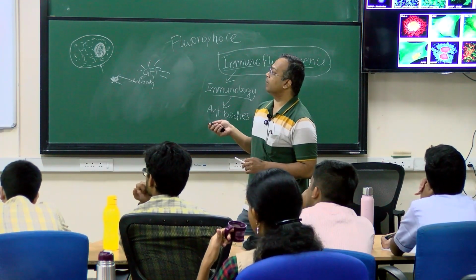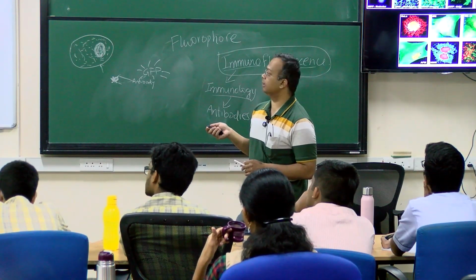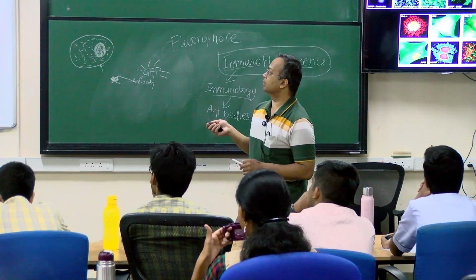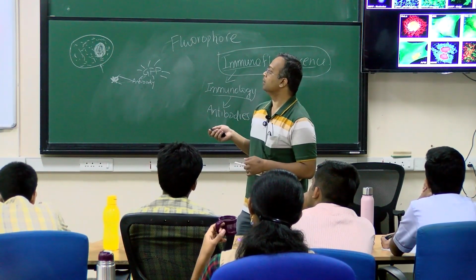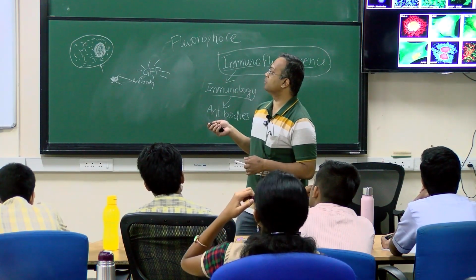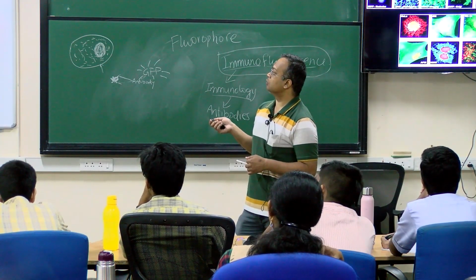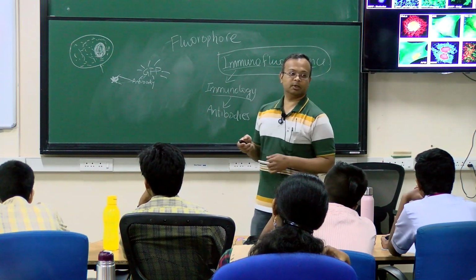Okay, and then vimentin is another protein in the cell that is labeled with green fluorescent protein, and then the Golgi body is stained with another green, yellow fluorescent protein, but it is labeled in a pseudo color. Then the endoplasmic reticulum is labeled in the red fluorescent protein, and the nucleus is labeled in the red. Okay. So where the nucleus is labeled, you can also see the nucleolus in the nucleus. So those are the different examples.